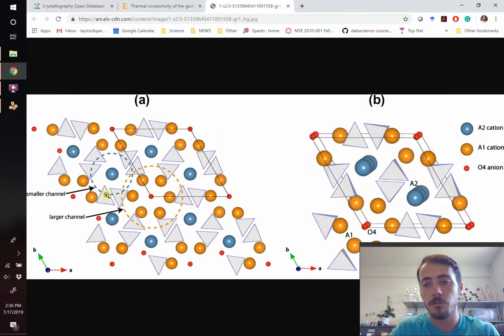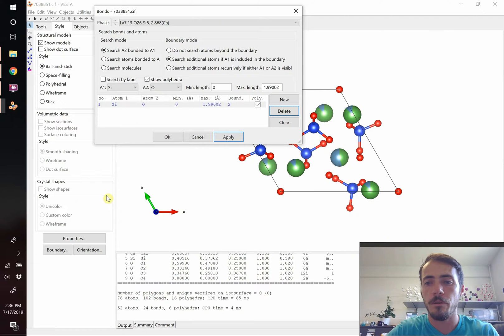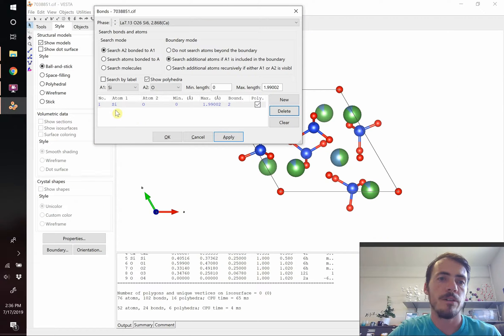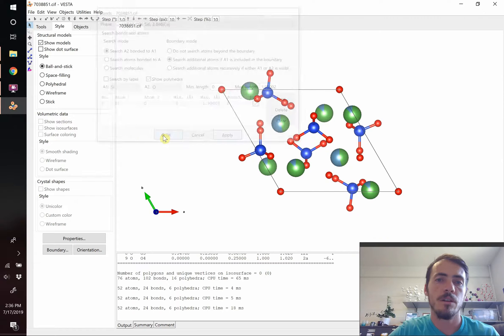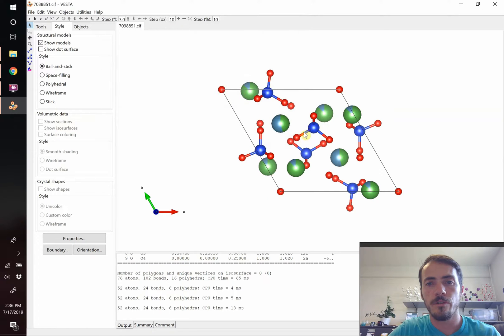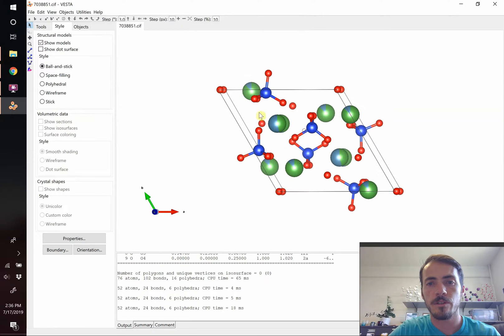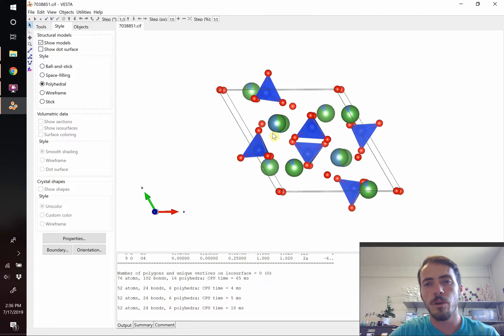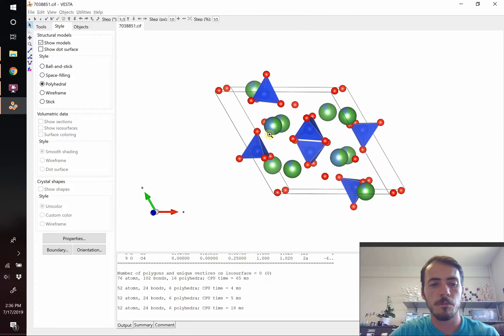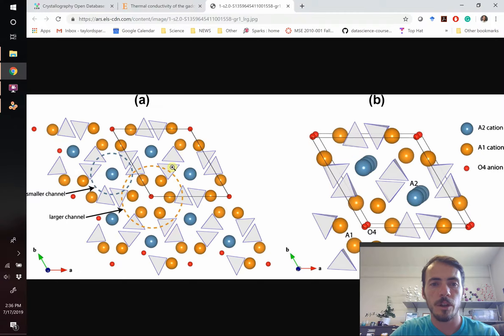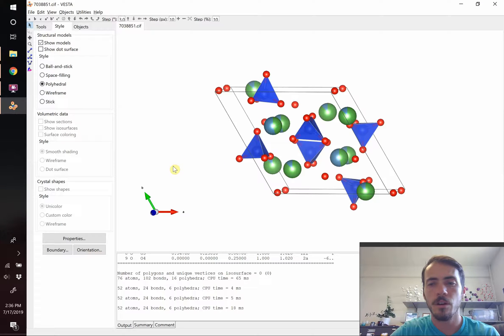So then we've got silicon bonded to oxygen, and sure enough, there they are. There's our silicon bonded to oxygen, we're going to hit polyhedral view, and we're going to change those to make those look like the polyhedral here later on.